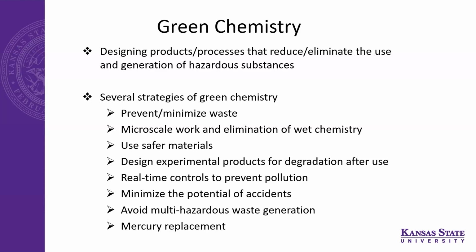Of course, use safer materials. Then design experimental products for degradation after use whenever possible. I know those may not be relevant all the time, but if possible, these are the things that we can do. And real-time controls to prevent pollution.